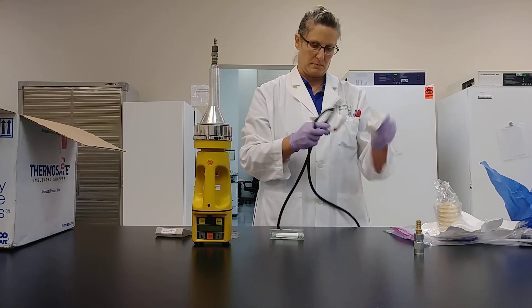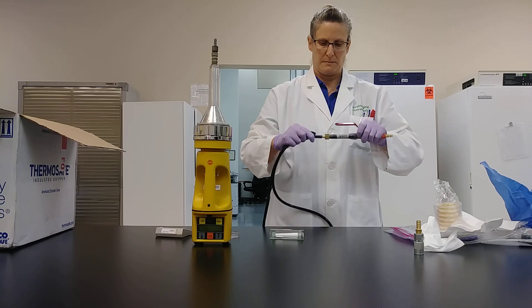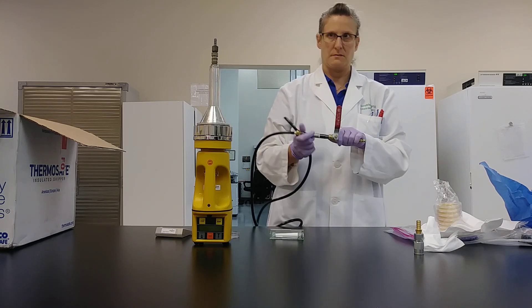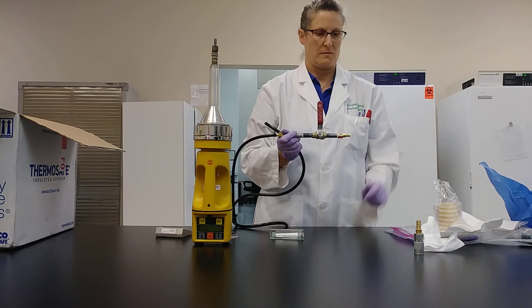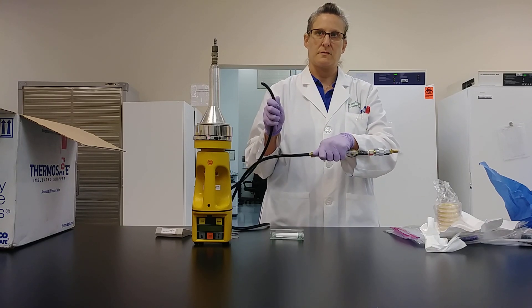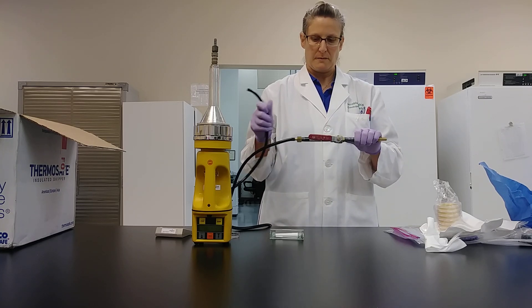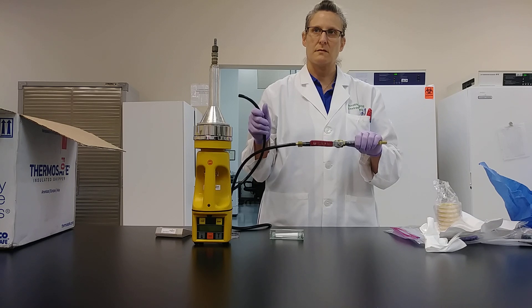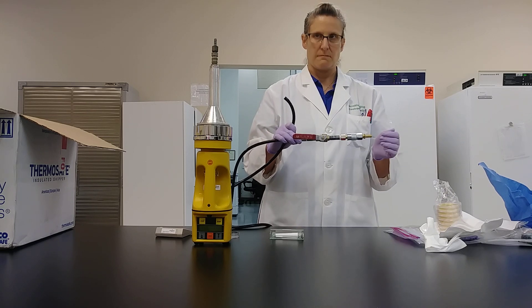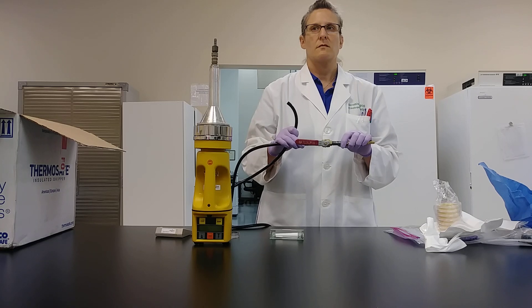Place one end of the tubing on the barbed end of the control valve. You'll want to flush your compressed air for no less than 60 seconds by turning the red handle of the control valve to the on position. While purging your air for 60 seconds, make sure that any tubing connected to your air system is also attached, so that you're purging the system for any contaminants that might be in there.